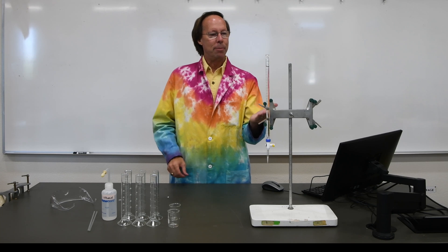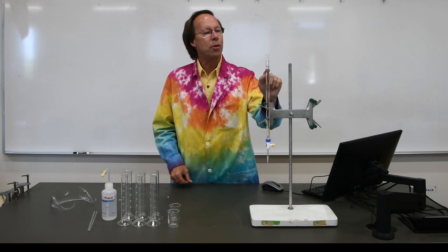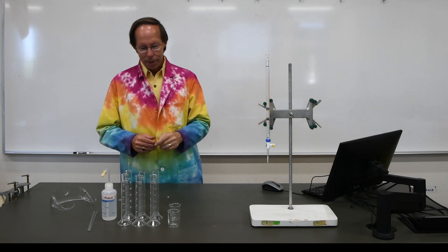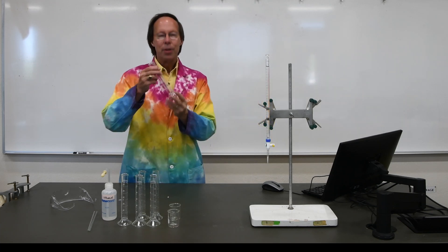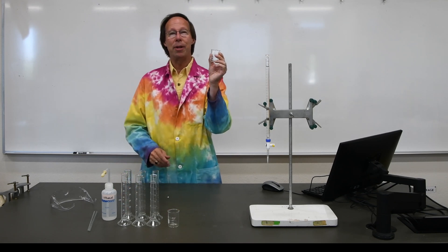I'm adding something to the lab today, which is a burette. Burettes are marked off to the nearest tenth of a milliliter, so they are ten times more accurate than the graduated cylinder, which is ten times more accurate than the beaker.